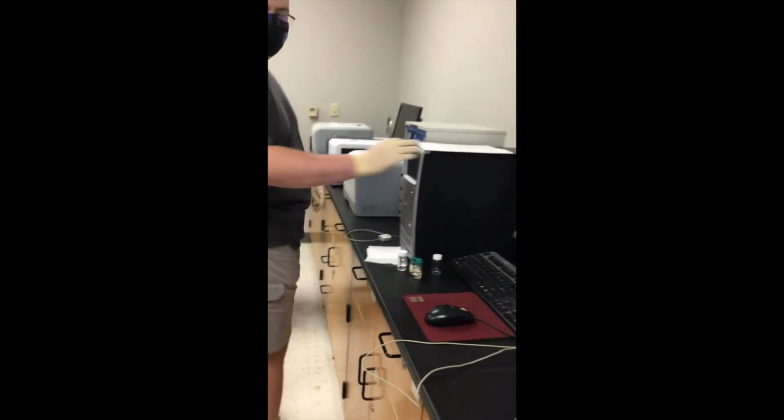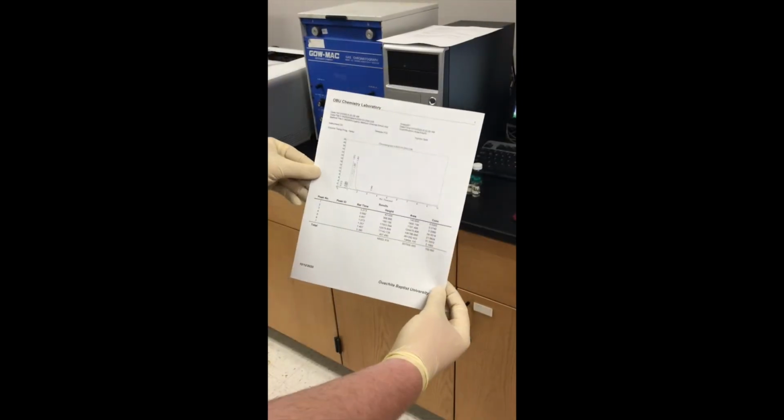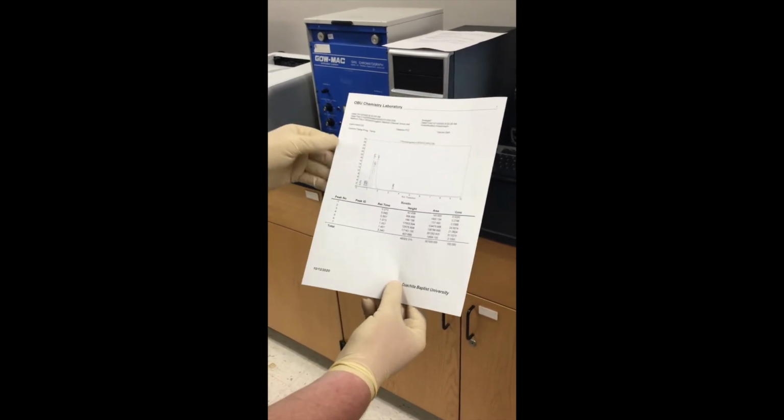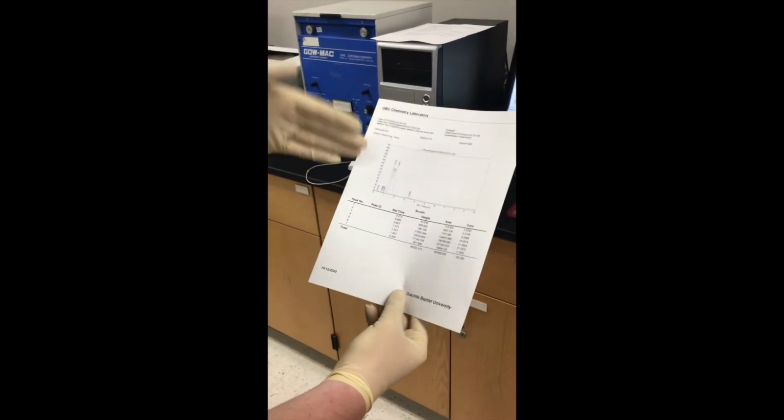So after this is done and you've got all your information, you can choose to print it. Just use the regular print button. And I've got an example chromatograph over here somewhere. Find it. So this is an example of a printed chromatograph that comes out over the printer over here to the left of all these GCs. And so it is identical to what you're seeing on the screen.